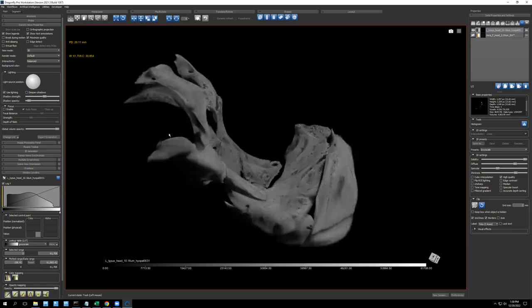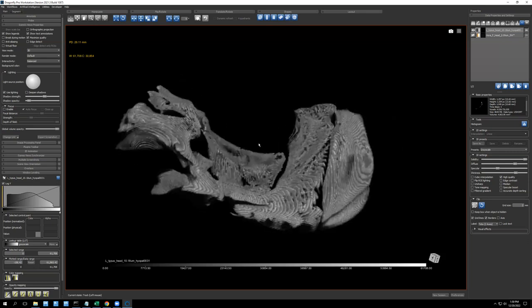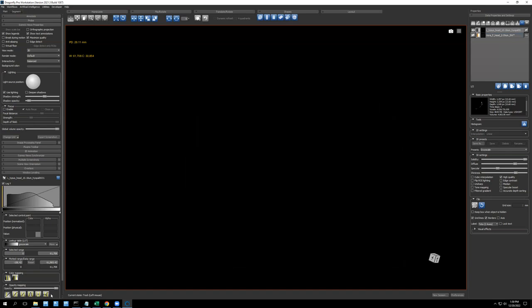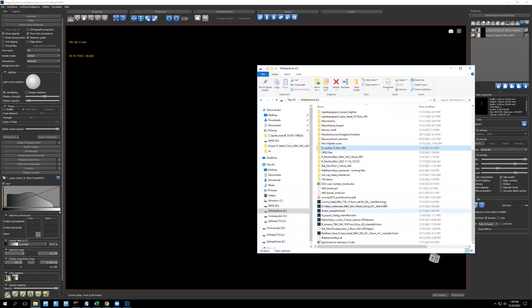So to now load a session, so we're in a session. To load a different session, I would turn this off. You can have 2 instances of Dragonfly running at a time, and that's it. Are you recording this? Yes. So you can only have 2 running at a time.